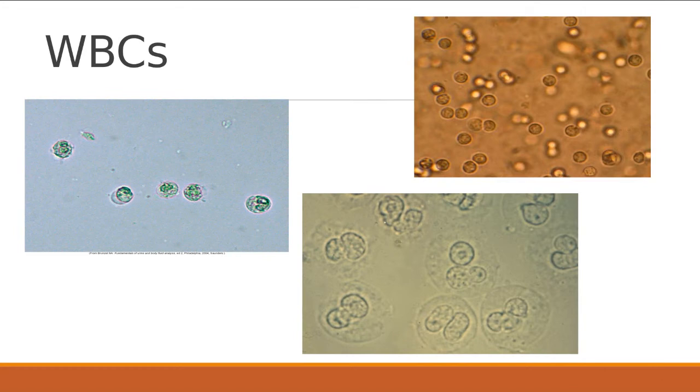They're spherical, so they're going to be that circular shape with cytoplasm, granules, and the nuclei segments. So on these down here, my drawing thing keeps going away. These down here, you can see the nucleus. Now it looks like a smiley face, but it's kind of segmented. They can clump in acute inflammation. So these down here are starting to kind of clump. They're pretty friendly, but they'll be in a tighter formation.